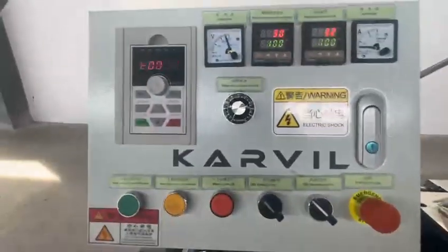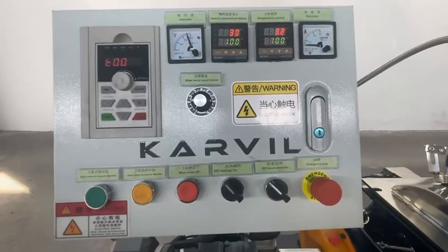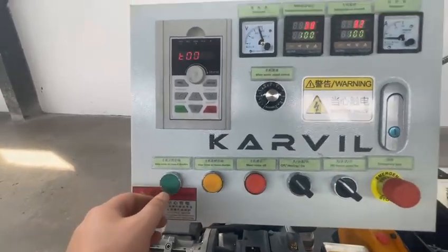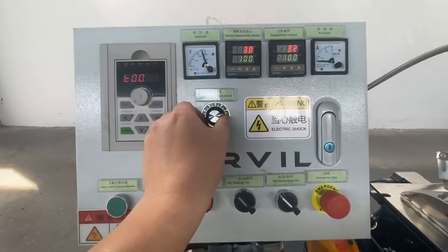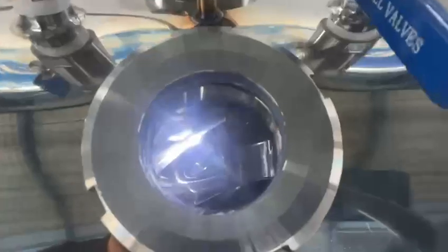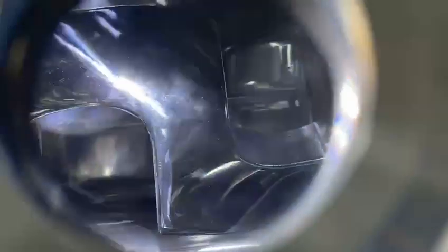First, we test the mixing forward direction. Mixing forward — start. Give it some speed. Let's check. Now the double sigma blades are rotating in the forward direction. We give it more speed.